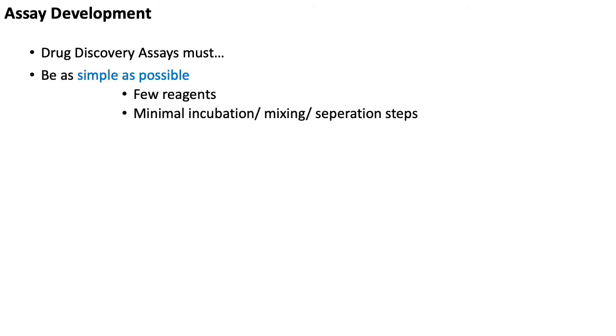So, assay development. The drug discovery assays must be as simple as possible. So we want to use very few reagents in our assay. There also needs to be a minimal incubation time and also minimal mixing and separation steps. It also needs to be cost effective, because we want to screen lots of compounds, but we don't want it to be too expensive.